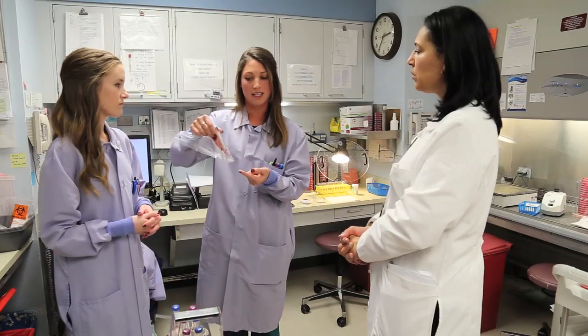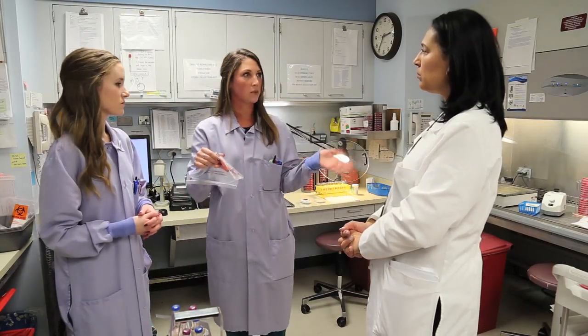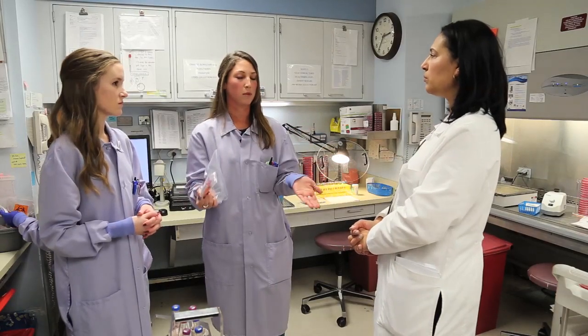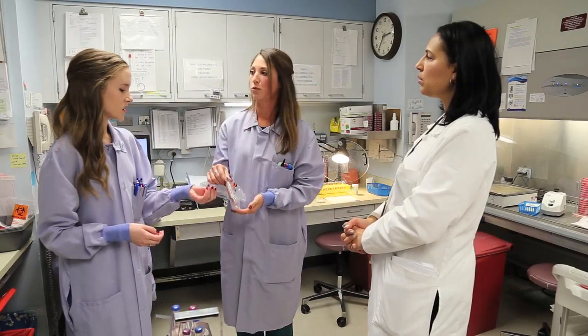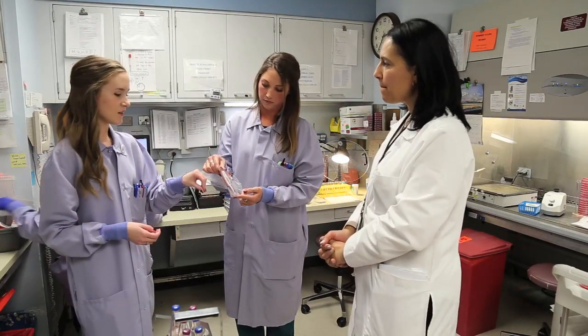Swabs, not only do they get stuck in this gel, we have about 7 plates we use for anaerobes, and if you have to plate all of those and a gram stain, you're using up the majority of whatever's on that swab. So it's much easier to recover things when you get the tissue. Specimen gets left behind in the gel too, so it's never a good idea.